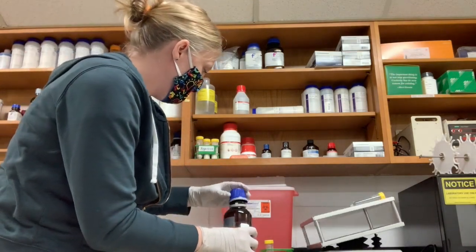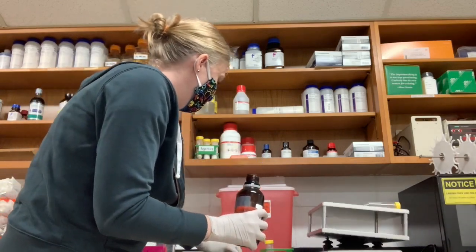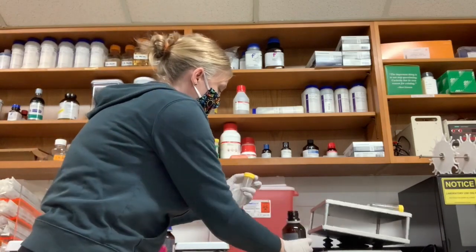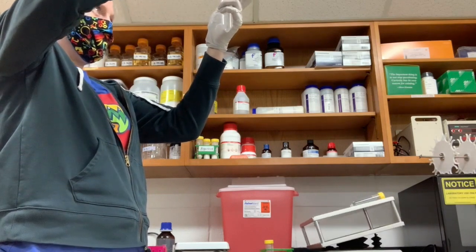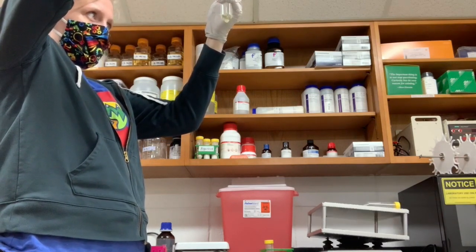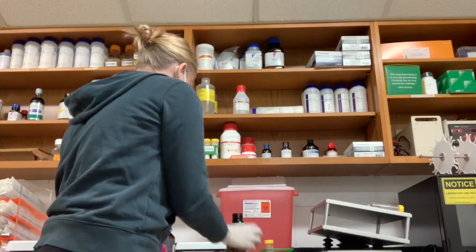milliliters. So I have my Tween 20 here, and I have my conical, and I'm going to very carefully pour until I have 5 milliliters. And there's a line on the side of the tube that you can see at 5 milliliters.